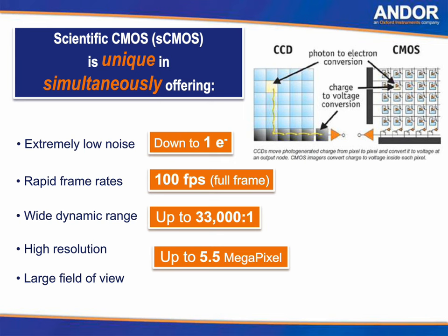So if you look at the diagram on the top right, what you should see is effectively a charge entering at the same time, so a higher energy photon going into either the CMOS structure or the CCD structure is moved differently. And this difference in how the transportation of the charge happens allows you to have this difference in performance. So if I look at the CCD, the charge enters into the pixel and then is effectively clocked down and then out along the surface. So it takes that individual photon a long time to move through the clock down and along. And that is the effective frame rate. So most CCDs are working in the regime of 4 or 5 frames per second.